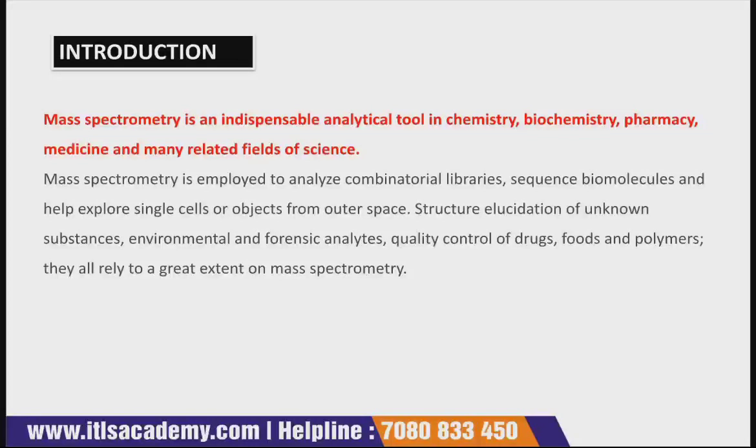As I have told you, this technique is a micro analytical technique which requires only a few nanomoles of the sample. Micro means very small, so they require very few nanomoles of the sample. Why do they require these nanomoles of the sample? Just to obtain the characteristic information of the particular molecule, its structure and the weight of the analyte. So this technique is also known as a micro analytical technique.